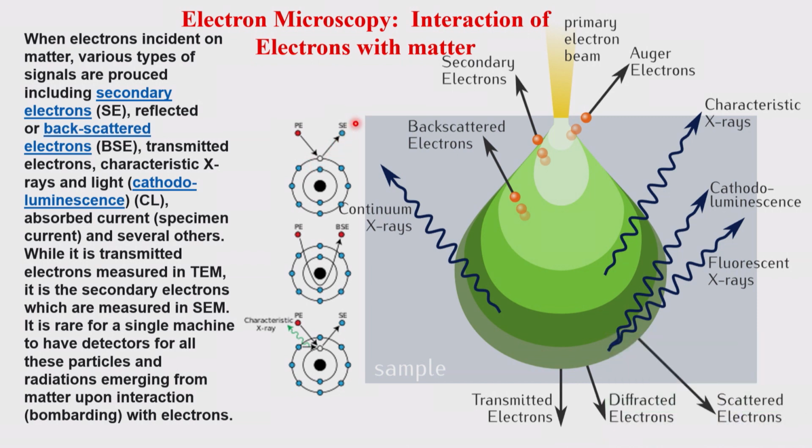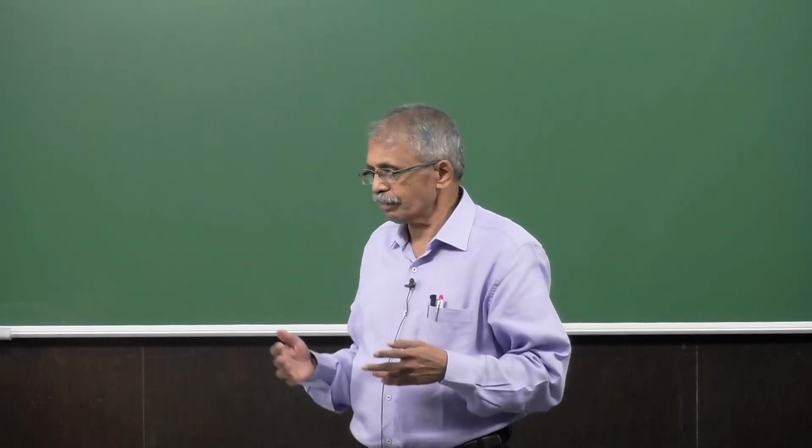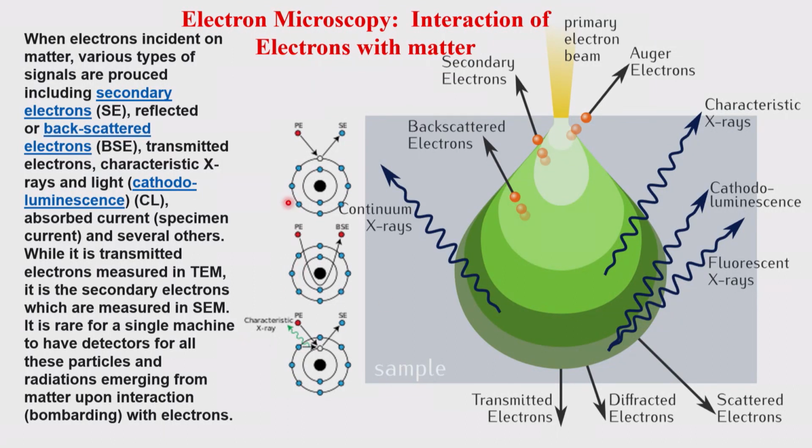And this is what is measured in the case of scanning electron microscopy. The primary electron beam that does not touch anything goes out, is backscattered, and comes out with very little difference in its energy, so it is still very high energy. Then another thing: when an electron has been knocked out and another electron comes into its place, the difference in energy comes out as characteristic X-radiation. I have not talked about X-ray fluorescence, but I have given an idea of it earlier as well. And these are different processes.